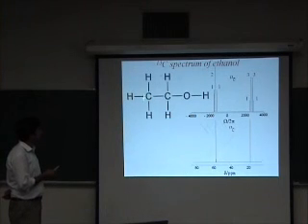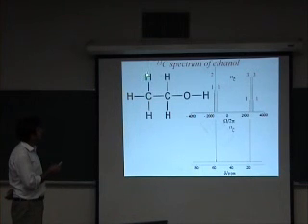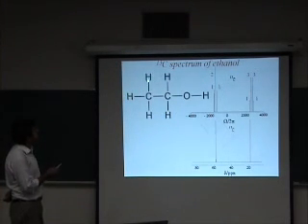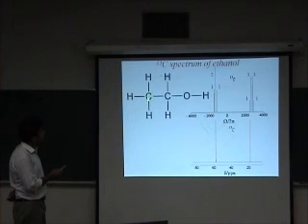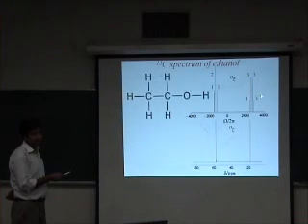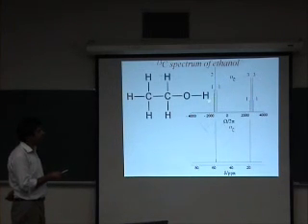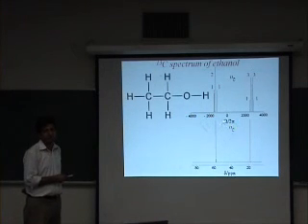Now, if you look at this carbon-13 nucleus, the other isotopomer, this is coupled to three protons. And each of these protons, of course, is NMR active. It is spin 1/2. So as a result of the coupling to the three protons, the peak of this carbon-13 is split up into 4 peaks. The multiplet is a quartet. It comprises 4 peaks, and the ratio of these 4 peaks is 1 to 3 to 3 to 1. Now, how do we explain the origin of this finer structure? Any questions so far?